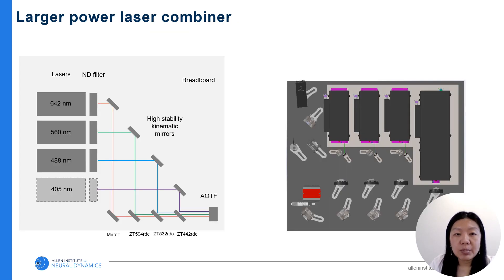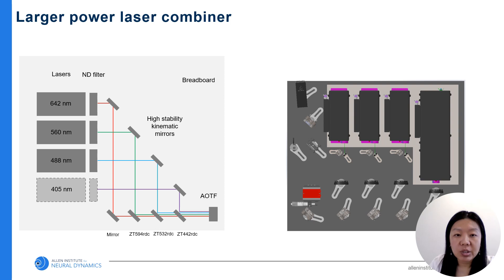We built a custom laser combiner with 1W lasers. Right now we have three lasers: 642, 560, and 488 nm. We are still exploring the addition of a 405 nm laser. All lasers use an AOTF, or acousto-optic tunable filter, to modulate the output power.